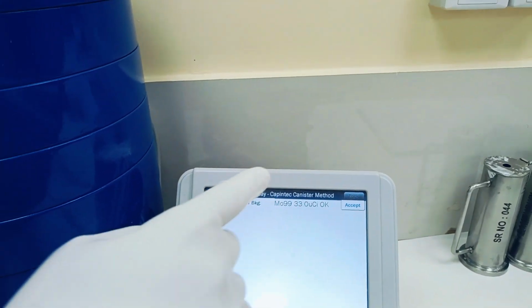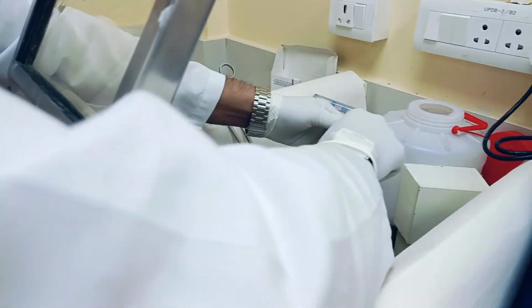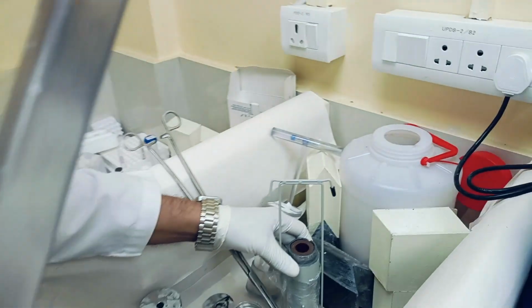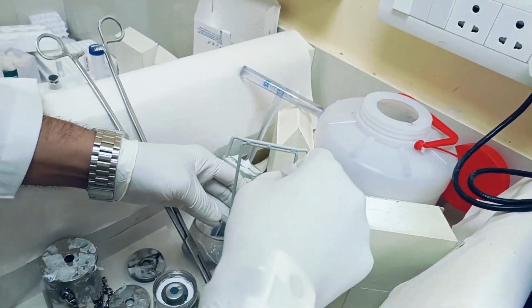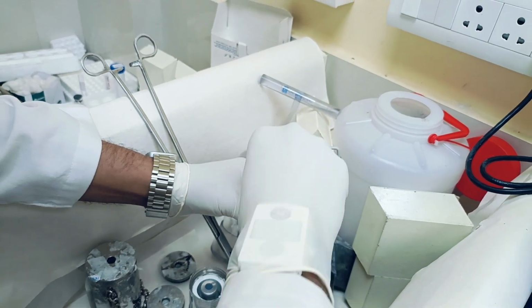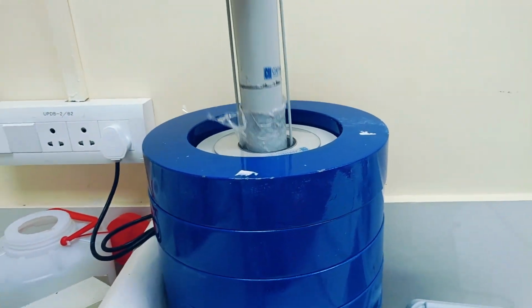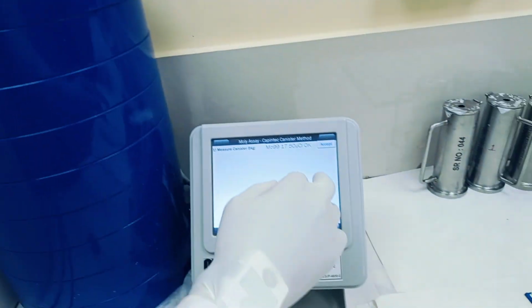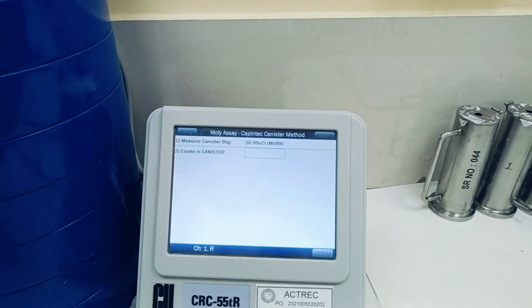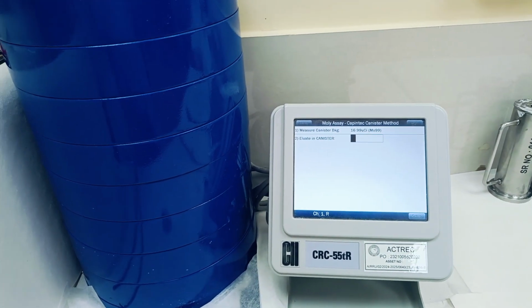So once this is done, we'll take this out again, and inside this canister we have taken this radioactive material, technetium 99m. We'll keep it in this Moly canister. And then we will put it again back into this, and now we'll say accept. So it will start measuring what is there in the canister with eluate.